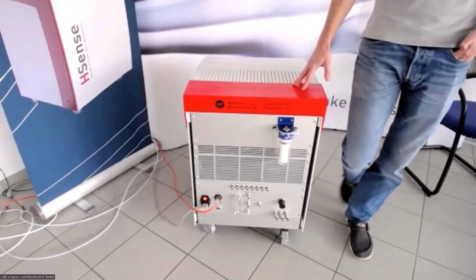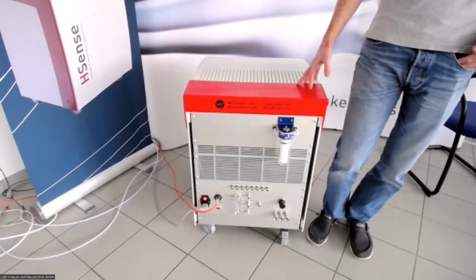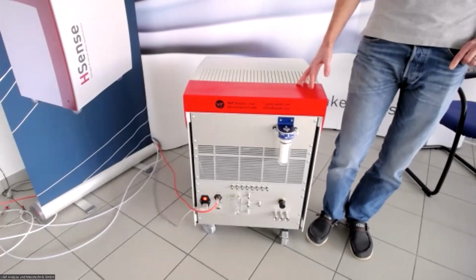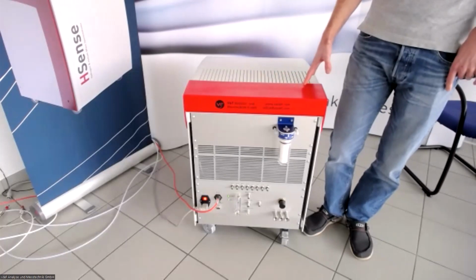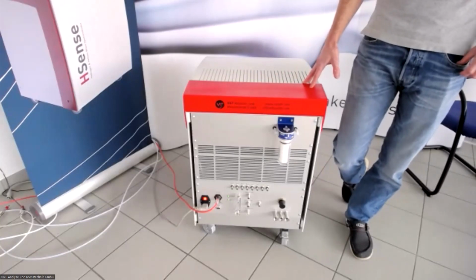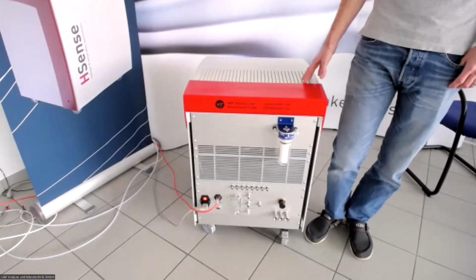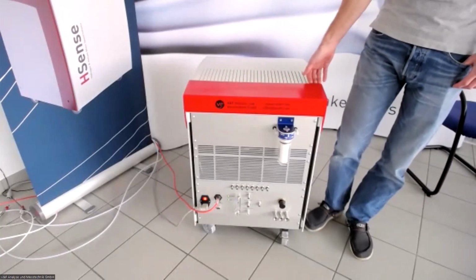The reason for that is that background values for the hydrogen signal will need a certain amount of time when you freshly start the instrument. So we are usually recommending with HSense instrument, it should run for at least 3 to 6 hours before measurement results will be valid. That's also the reason it doesn't make sense to switch it on and off every day, because it should just be running so that it's always ready to be used.